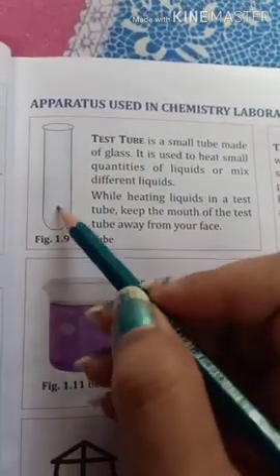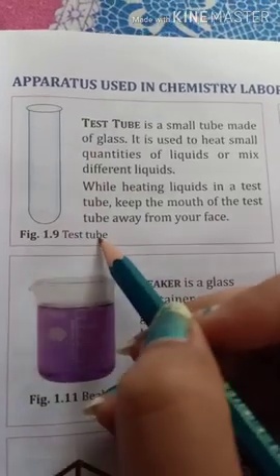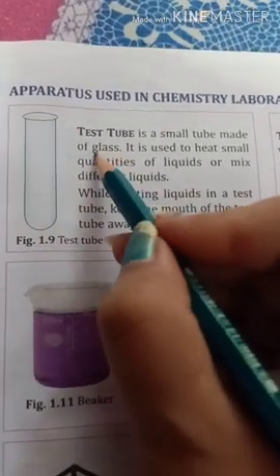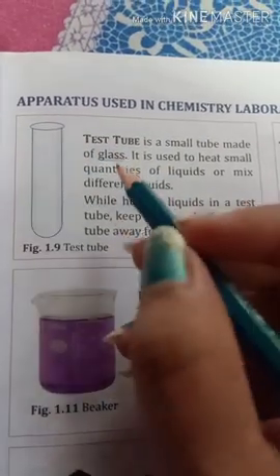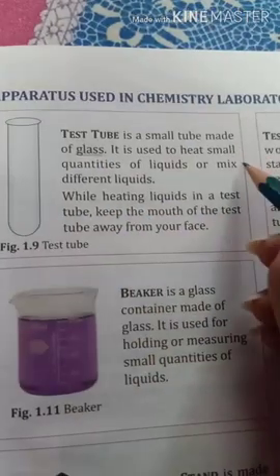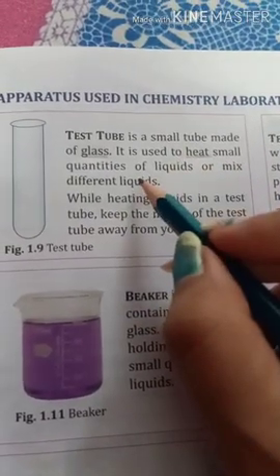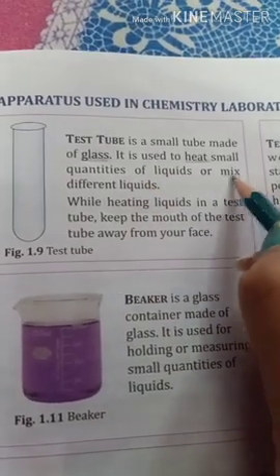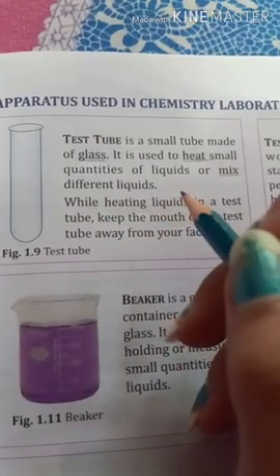So the very first apparatus used in chemistry laboratory is the test tube. This test tube is made up of glass and is used to heat small quantities of liquid in the laboratory, or used to mix different liquids in the chemistry laboratory.